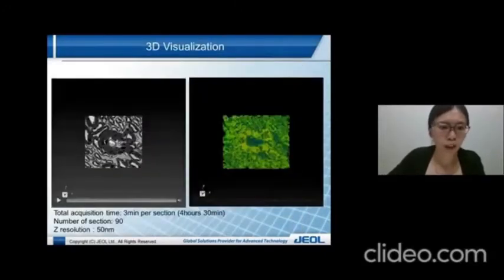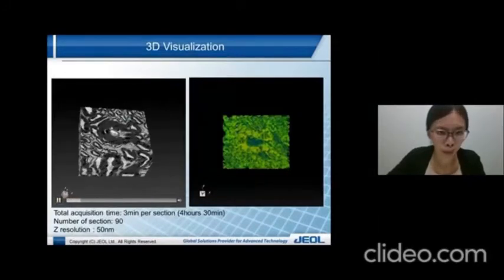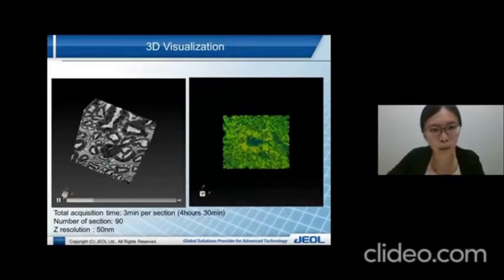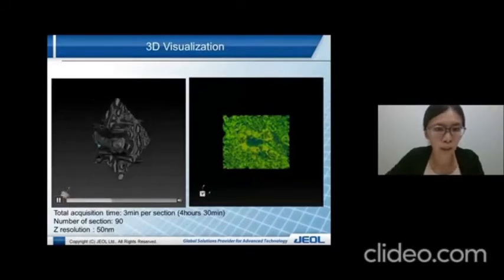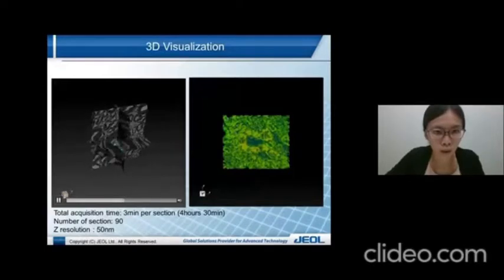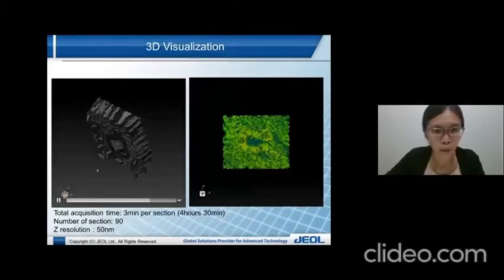So now I have examples of 3D reconstructions of the nervous system. And here we can observe the myelin, and the myelin is surrounding the axon in three dimensions. And this is a cross-section view. And also we display it in a 2D plane to see the structure inside the myelin in cross-section view. Besides that, we also observe the morphology change of the myelin throughout the space.